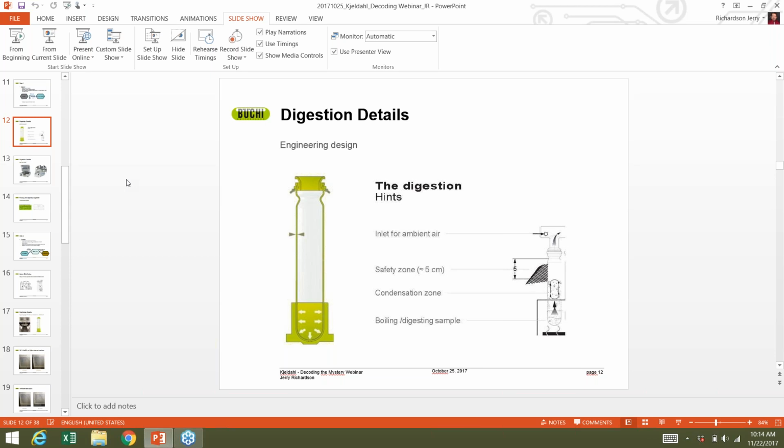On the other hand, let's say you're a nutraceutical company and you're making a protein powder, if you will. Dumas is a perfect fit for that type of application, or some kind of an oil, or some kind of a yogurt, or something that's got a much higher quantity of nitrogen and commonly packaged in a protein of some sort. Then Dumas actually is a very, very good system. It's very short, it's a combustion technique, it does not require digestion, the sample prep is only a couple of minutes, and it's a very consistent process. The only complication, again, or the biggest issue, is sample size. So if you want to call me, we'll talk offline, and we'll make sure that we're going down the right road for your best fit.